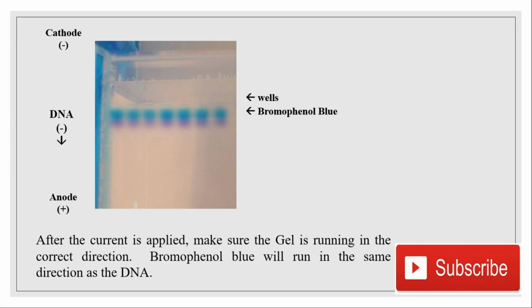So this is the gel picture after running 30 minutes. You see that this is the cathode, the minus sign, and here is the anode, the positive sign. Here is the DNA that moved from this position to this position, and you also see this is the well and this is the bromophenol blue that we use at loading time. Behind it will be the DNA sample, and upside is the bromophenol blue. You can clearly see it in this picture.